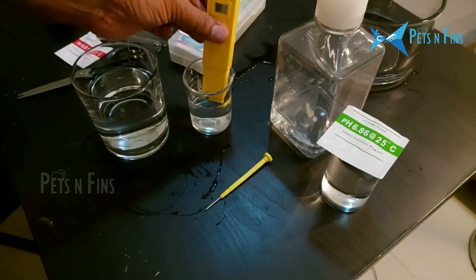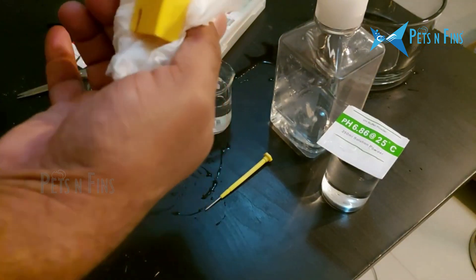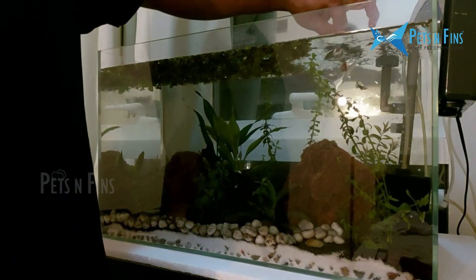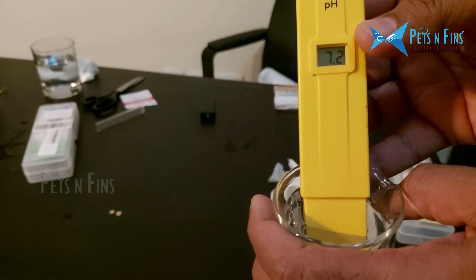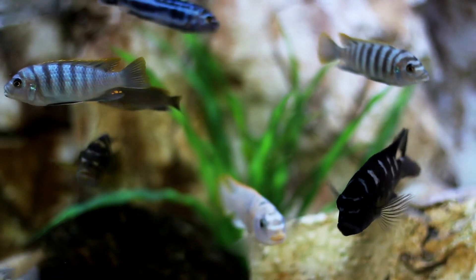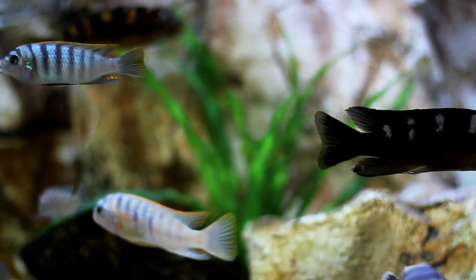We take distilled water, dip and shake the probe, then take a pH test. The pH reads 7.2. That is exactly the pH required. We will compare it with another pH strip to verify the pH meter calibration.